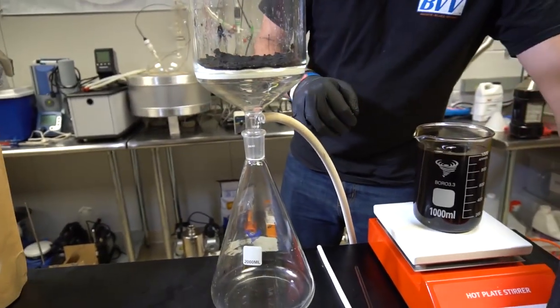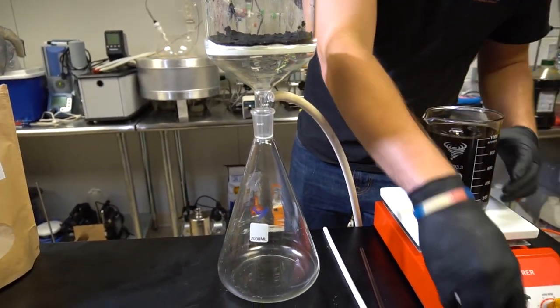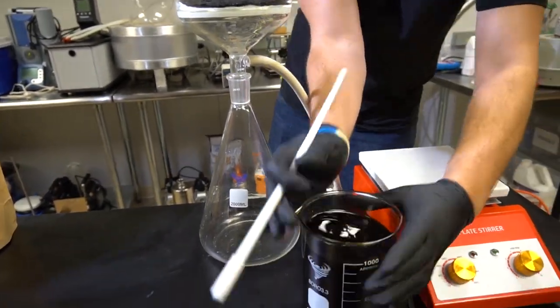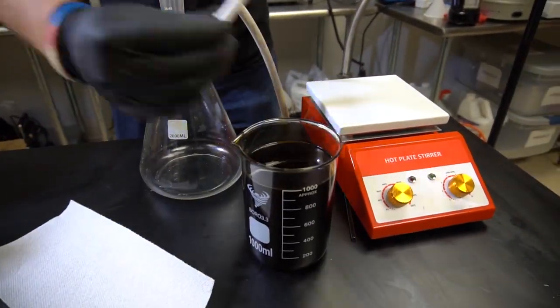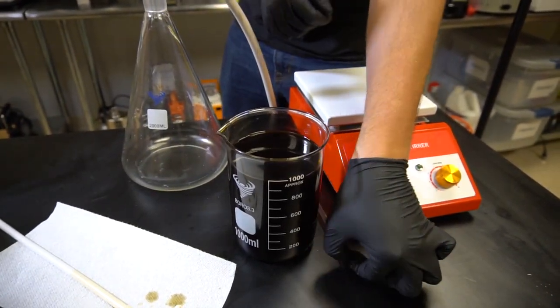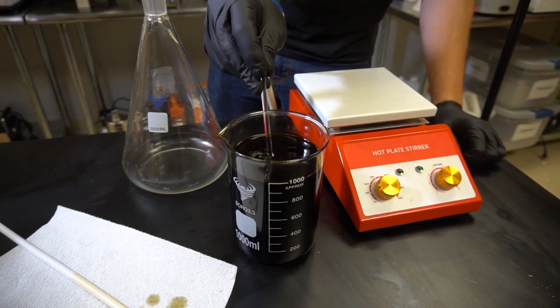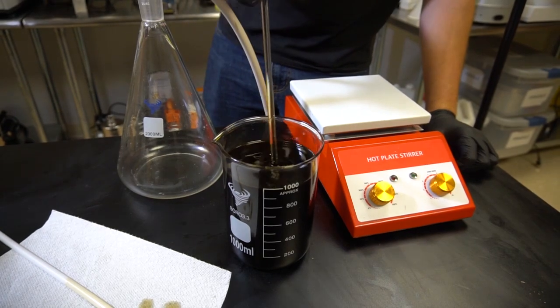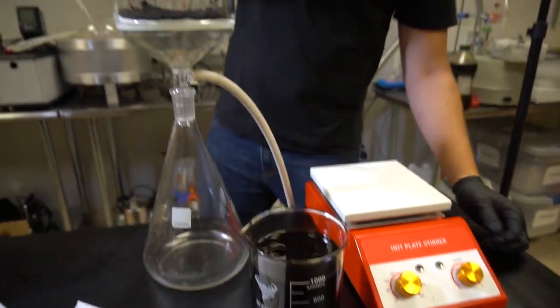I'll turn off my stir plate over here. I have a stir bar in there I need to get out first. Now just to make sure, I'm going to check the consistency with the stirring rod. And it seems just fine. So, I'm ready to pour it in the top of my Buckner funnel.